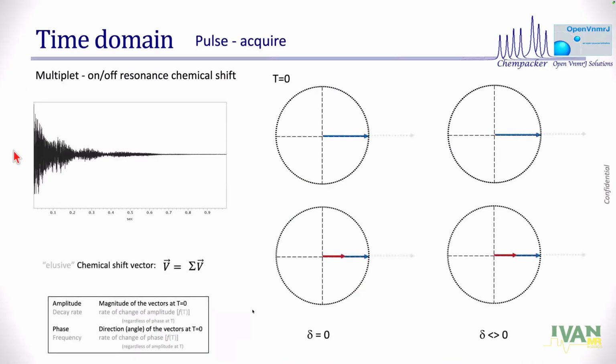So let's take a look at how we think about doublets or multiplets. In this case, I took a multiplet. So if I take a multiplet, I slowed down a little bit in the spin, because perhaps think of it, I am in a benchtop now. It's spinning slower. And so there is a J vector that I again deliberately slowed down just for convenience. So there's a doublet on the top, and there are quartets in the bottom, or any multiplet you can think of. The chemical shift is the vector average of all the vectors that describe that multiplet.